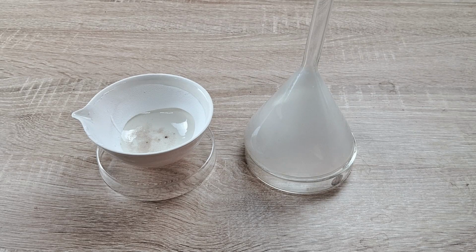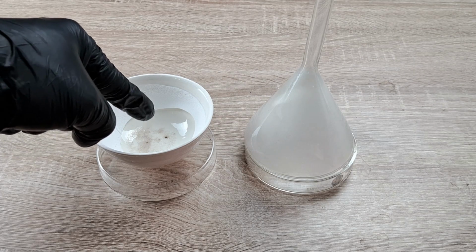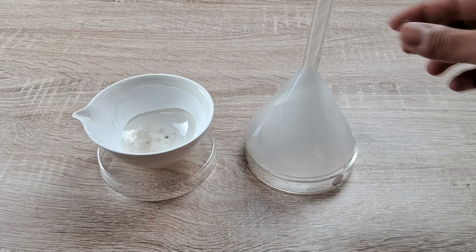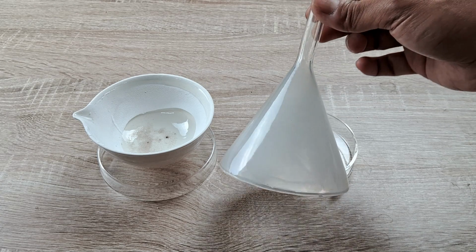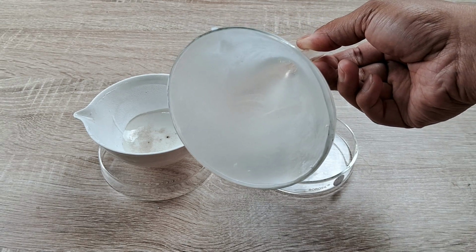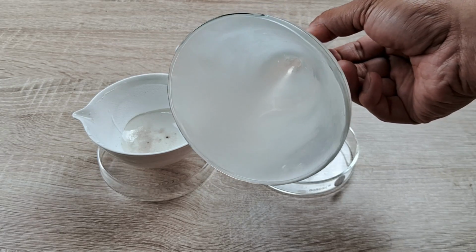At the end of the reaction, you can see that all the solid ammonium chloride crystals in the china dish have disappeared and are completely deposited as white residue on the inner walls of the funnel and even on the sides of the porcelain dish.